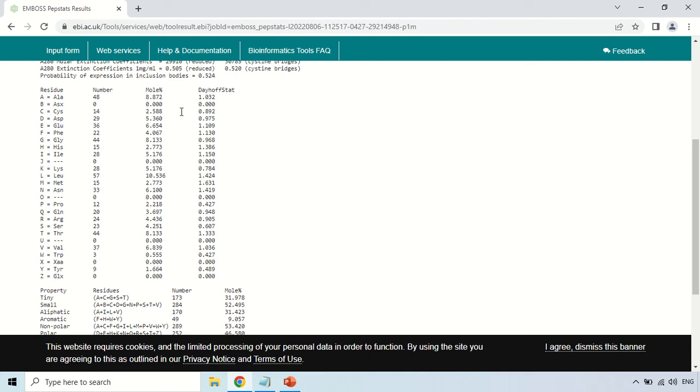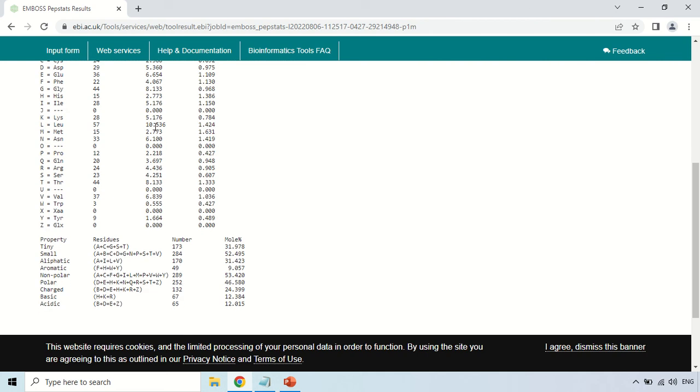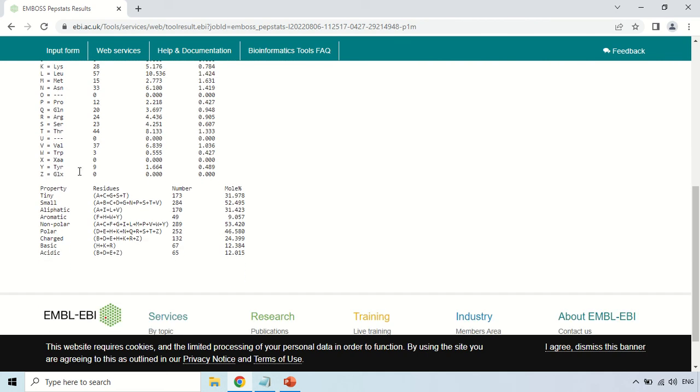Similarly the second one is B, here it is 0. Third one C means cysteine, so there are 14 cysteines in the sequence. The molecular percentage is 2.588 and the Dehoff stat is 0.892. This is all about all of the amino acids which are present in the sequence.